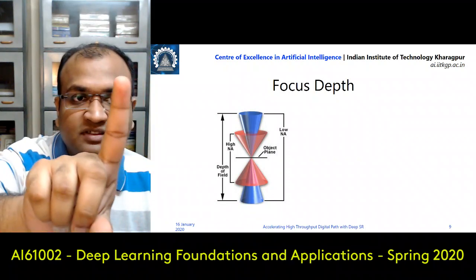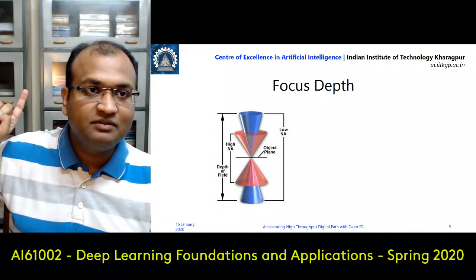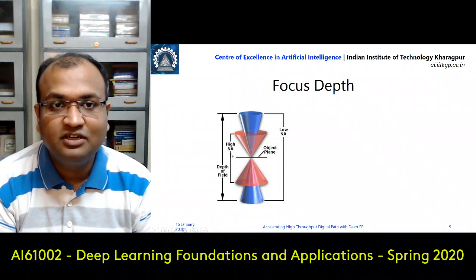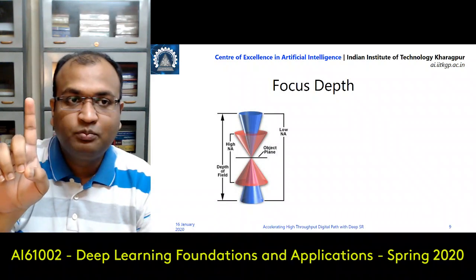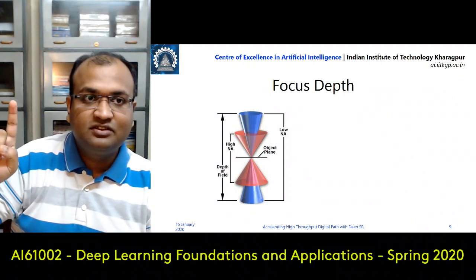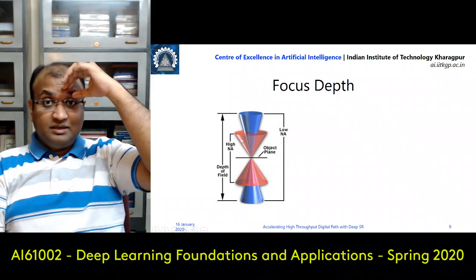Now when it comes somewhere over here or here, this is where it becomes sharper, and then it keeps on going like this till a point over here that it will be sharp, and after that again it starts becoming blurry. So this is the impact which is happening because of this kind of a numerical aperture problem, and which creates a limited depth of focus. So this point from where you can see my finger in focus to this farthest point where it can be in focus is this whole double cone like structure which you see over here, and that is the depth of focus.